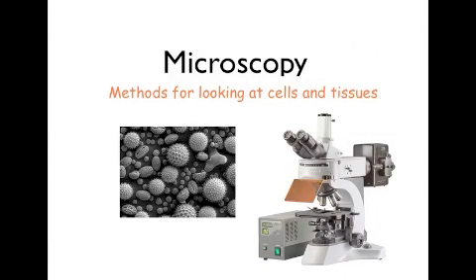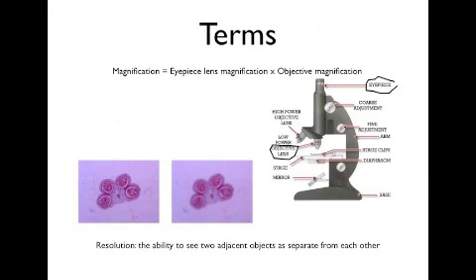So today I'm going to talk about microscopy. First I'm going to introduce the two terms that are relevant when talking about microscopy. The first one is magnification.